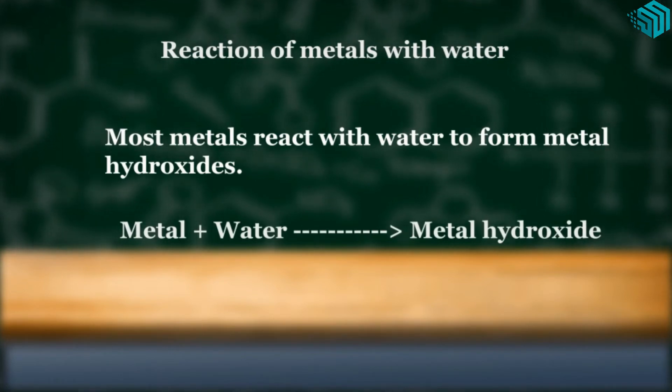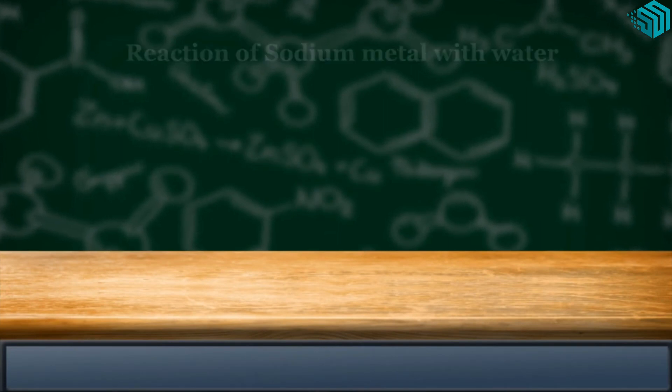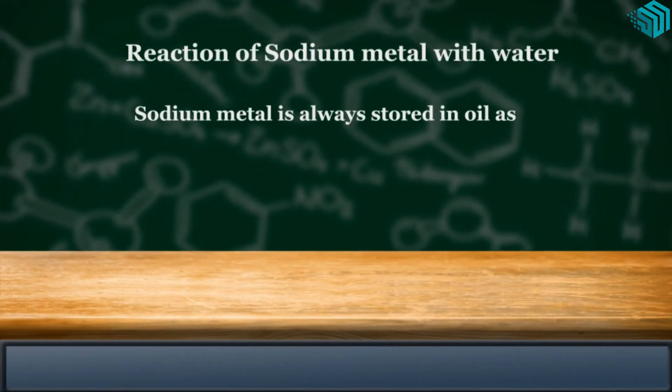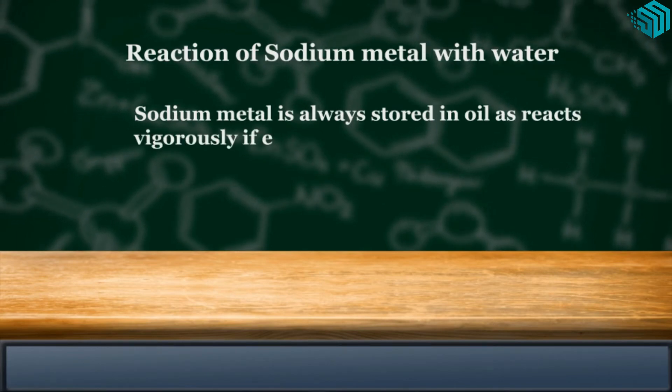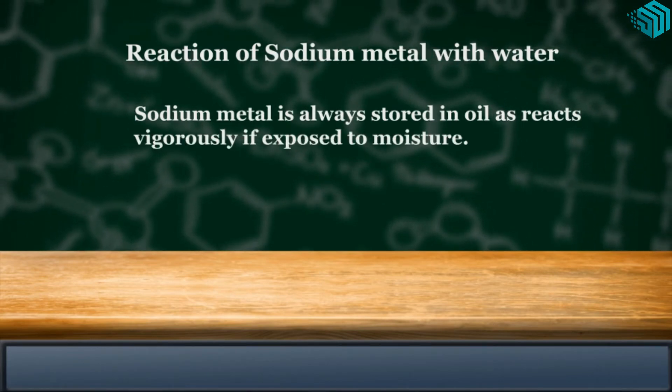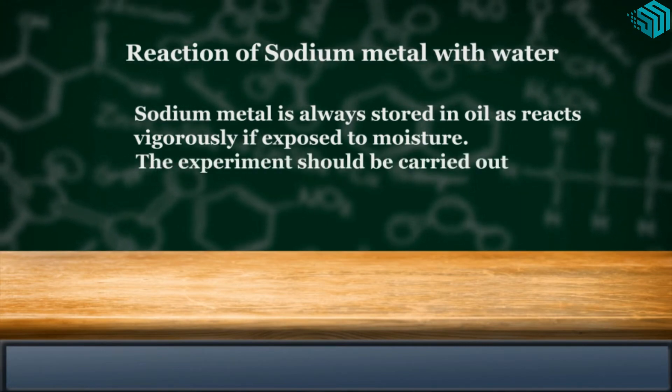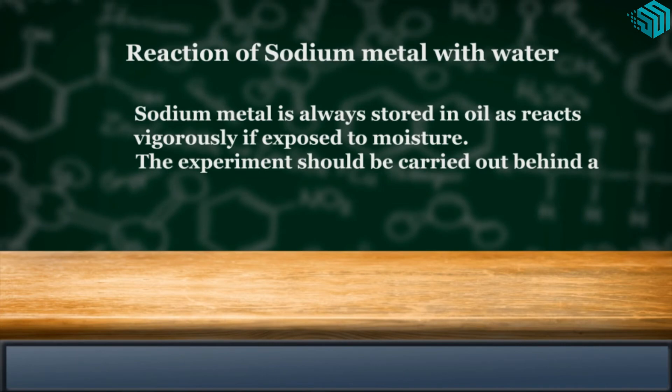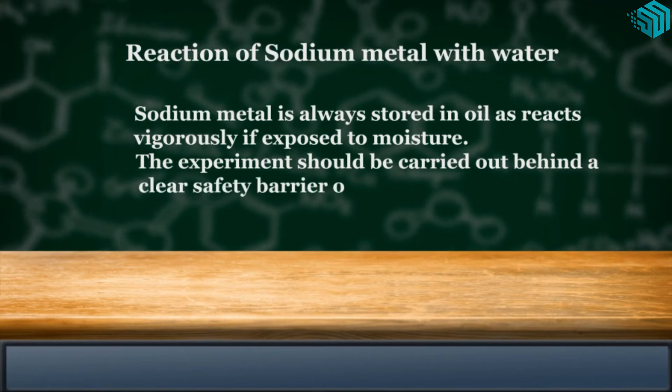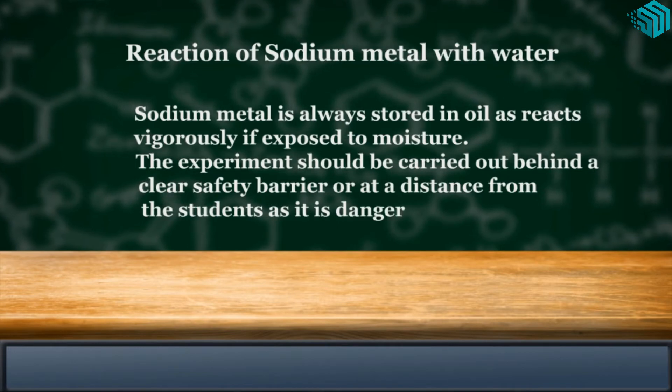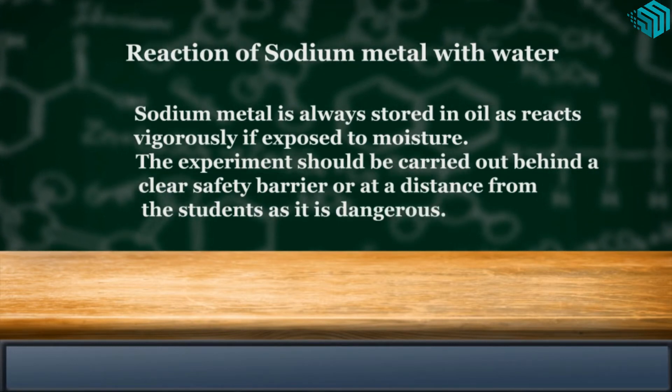Reaction of sodium metal with water. Sodium metal is always stored in oil as it reacts vigorously if exposed to moisture. The experiment should be carried out behind a clear safety barrier or at a distance from the students as it is dangerous.